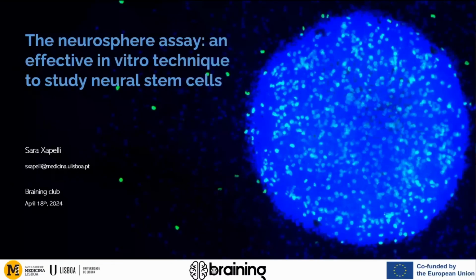Today I will talk about the neurosphere assay, and in order to do so, I will give you just briefly an overview about the background. Okay, so we have a really different student type, let's say from medicine to neuroscience, from bachelor, master, PhD students, so different backgrounds. So I think it is good and important to first know a bit about the background.